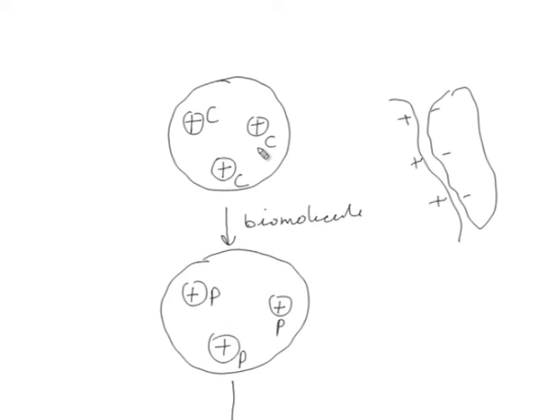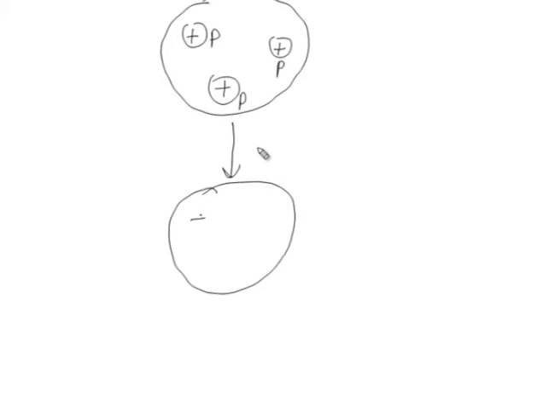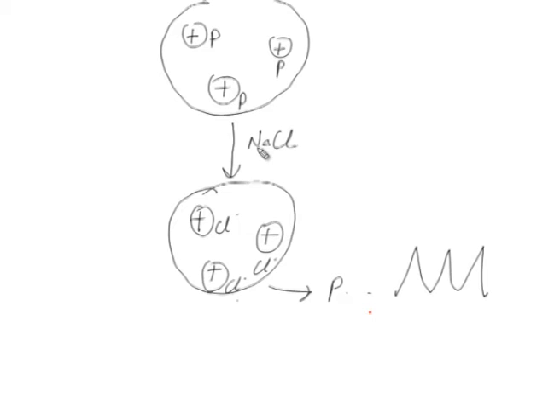This was binding, and the next step is elution, where you elute with NaCl or some other eluent. The positive charge will now be replaced by, say, chloride ion, and you will get the protein eluted. Remember, this is a mixture, so the proteins will come out at different strengths of the salt. You might get different peaks. Once this is done, simply regenerate.